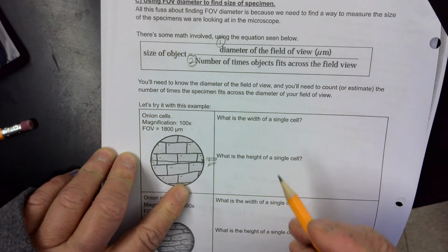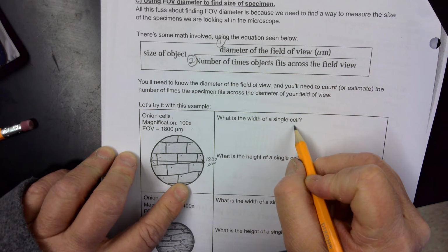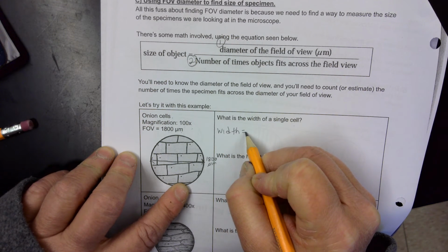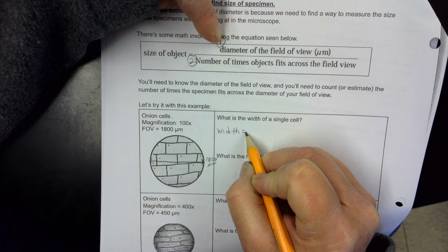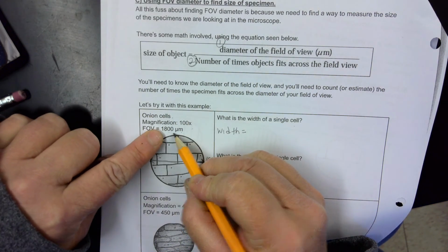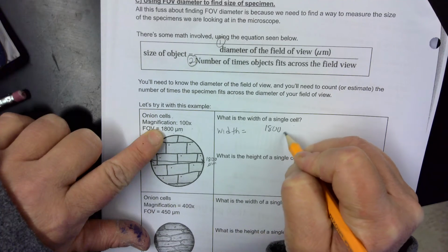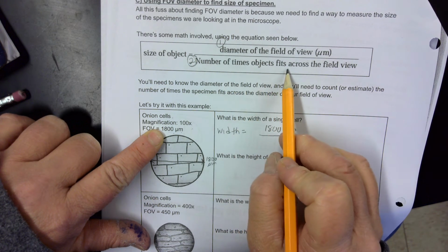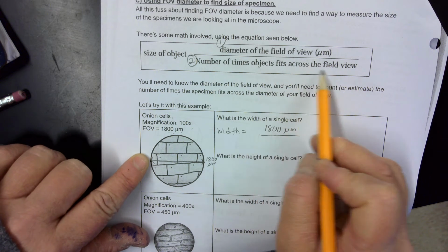Okay. So what's the width of a single cell? Well, going back to this equation, we need to know the diameter of our field of view, right? So it's already been determined that our field of view is 1800 micrometers. We're going to divide that by the number of times the objects fit across the field of view. So let's take a look.